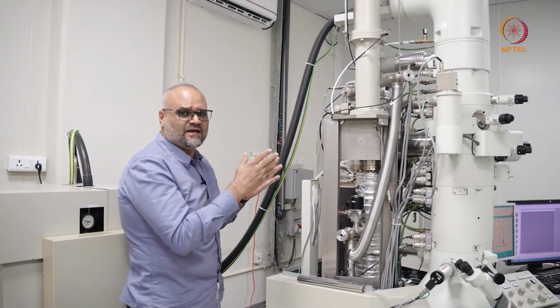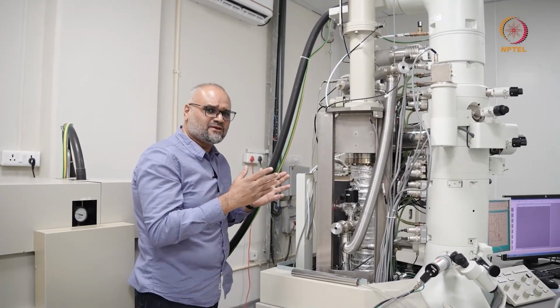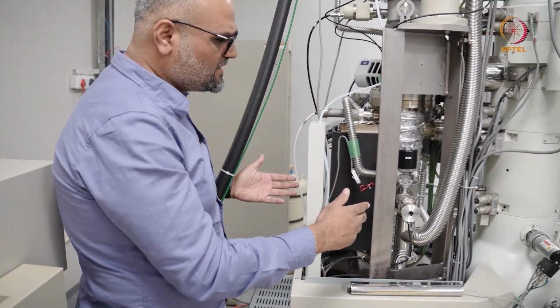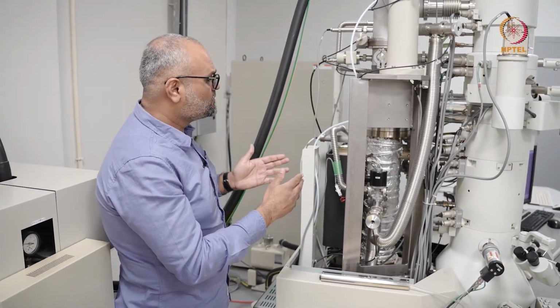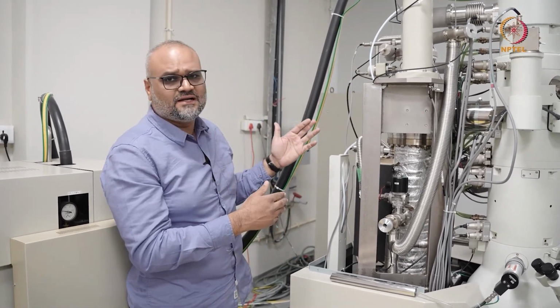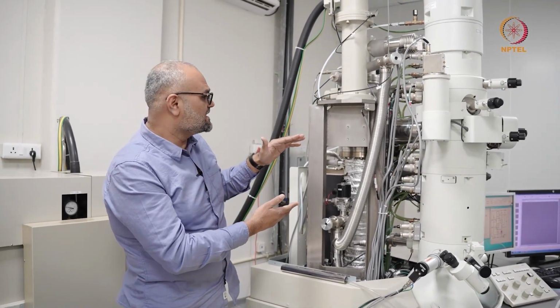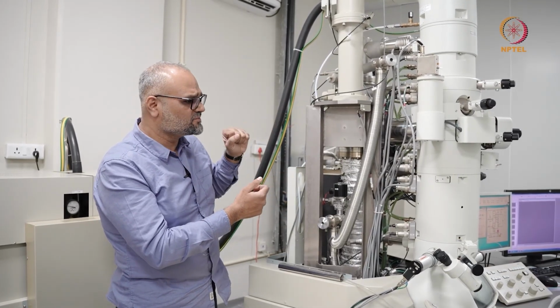The vacuum system of the microscope, as informed, runs under ultra high vacuum, and to obtain basic vacuum all through, you have a few roughing pumps in the background here. The roughing pump is connected to the oil diffusion pump. In some cases, you may have a turbomolecular pump, and once you achieve about 10 to the minus 3 or 10 to the minus 4 millibar, your oil diffusion pump starts, and once you steadily achieve a vacuum of around 10 to the minus 5 millibar, that is when your sputter ion pump takes over, and that is how you achieve ultra high vacuum in a microscope column.